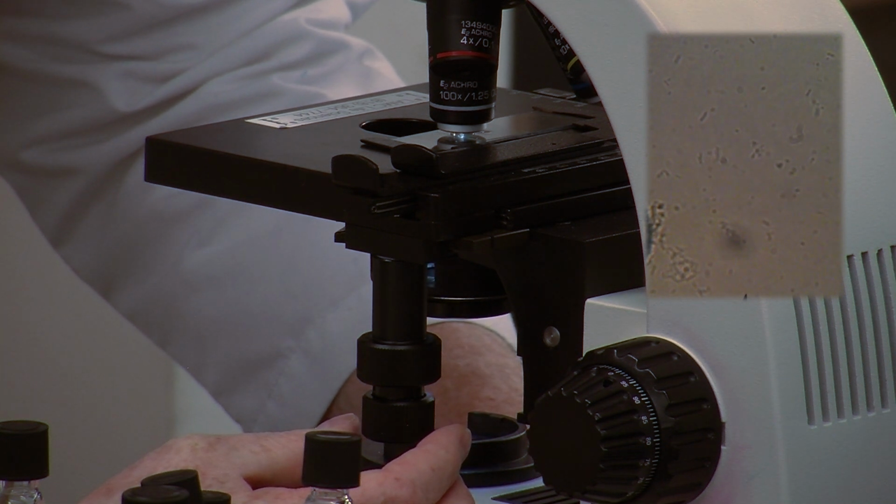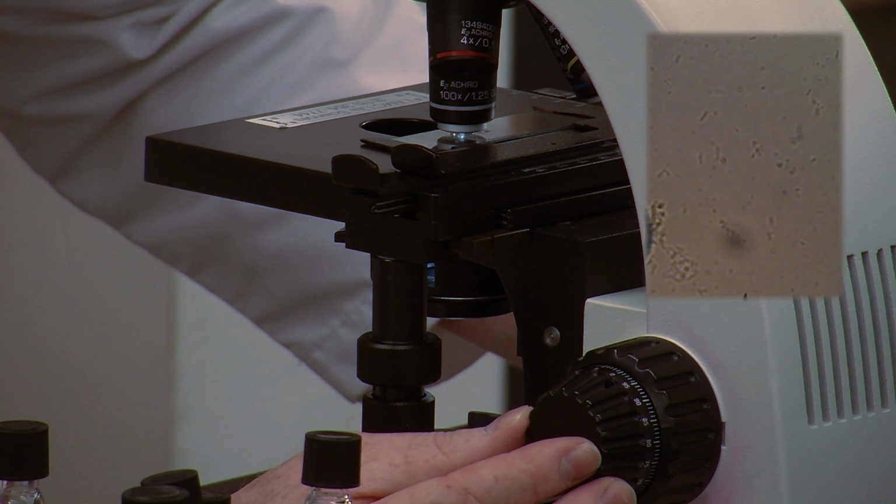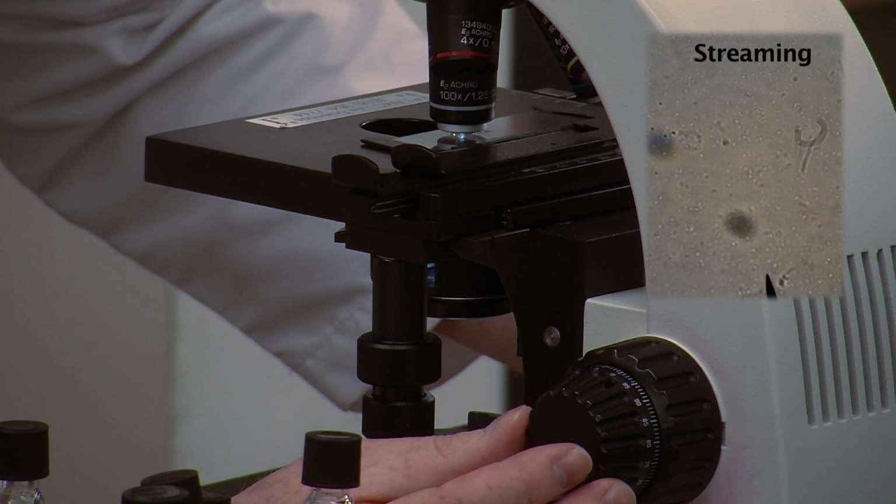The one thing you have to be careful with when you're judging motility using a wet mount is to avoid confusing streaming with motility. That's the one problem with a wet mount, is when the bacteria are streaming on the slide surface. It's kind of like floating down the stream. You can't confuse that with motility. So to avoid that problem, you'll probably want to do a hanging drop, which is what we'll do next.